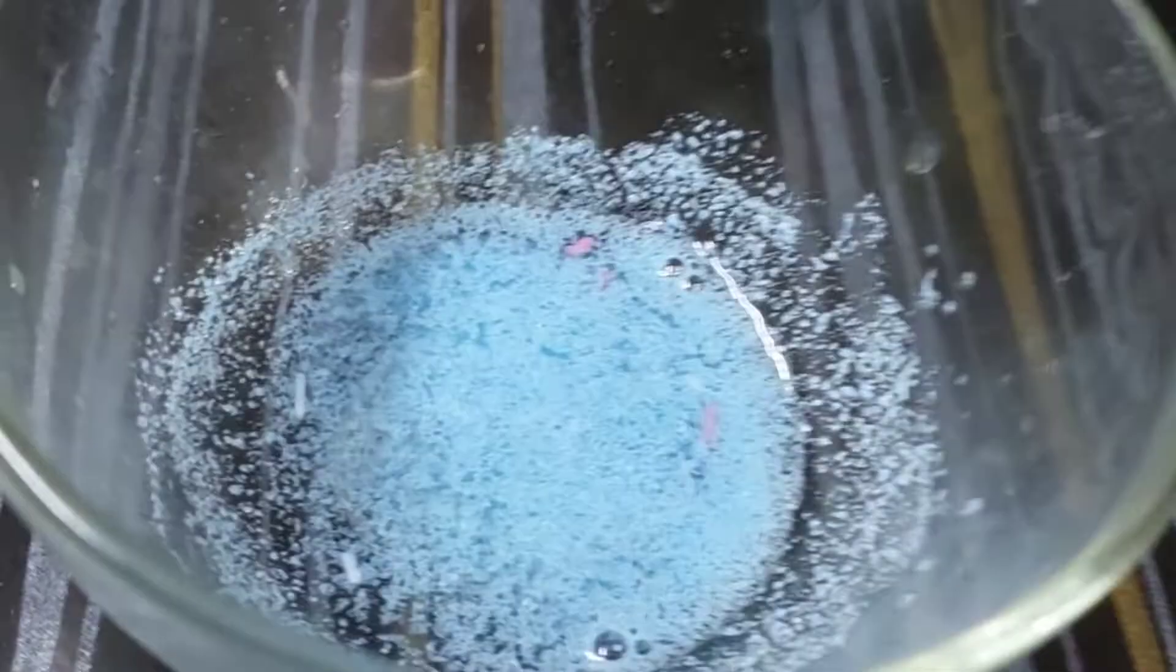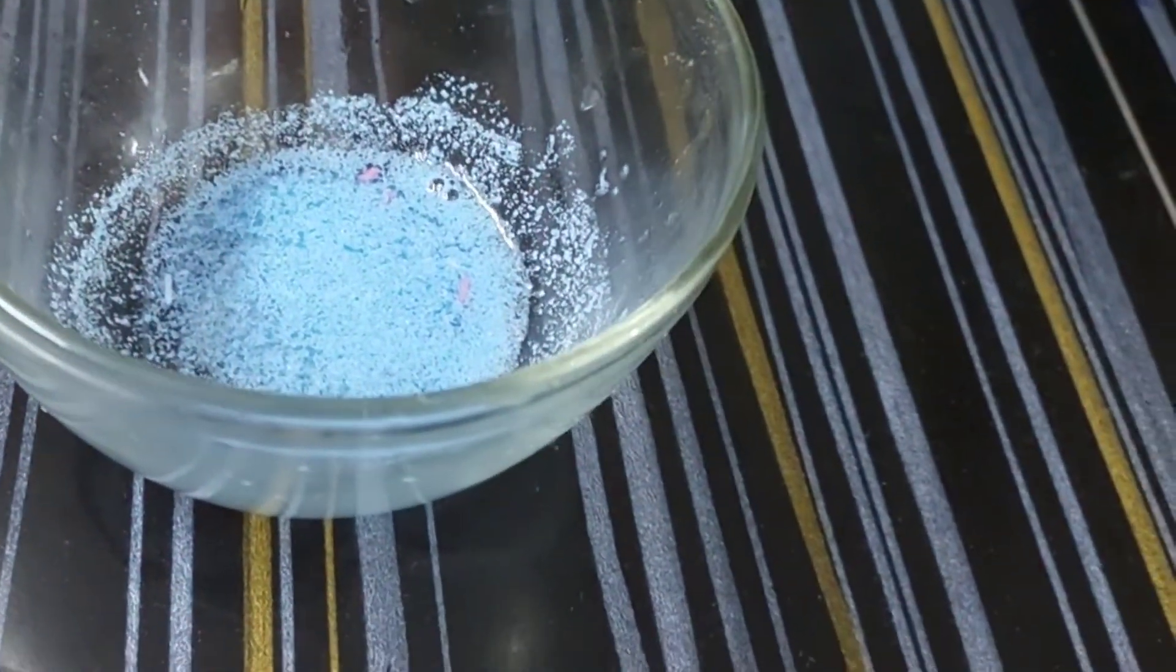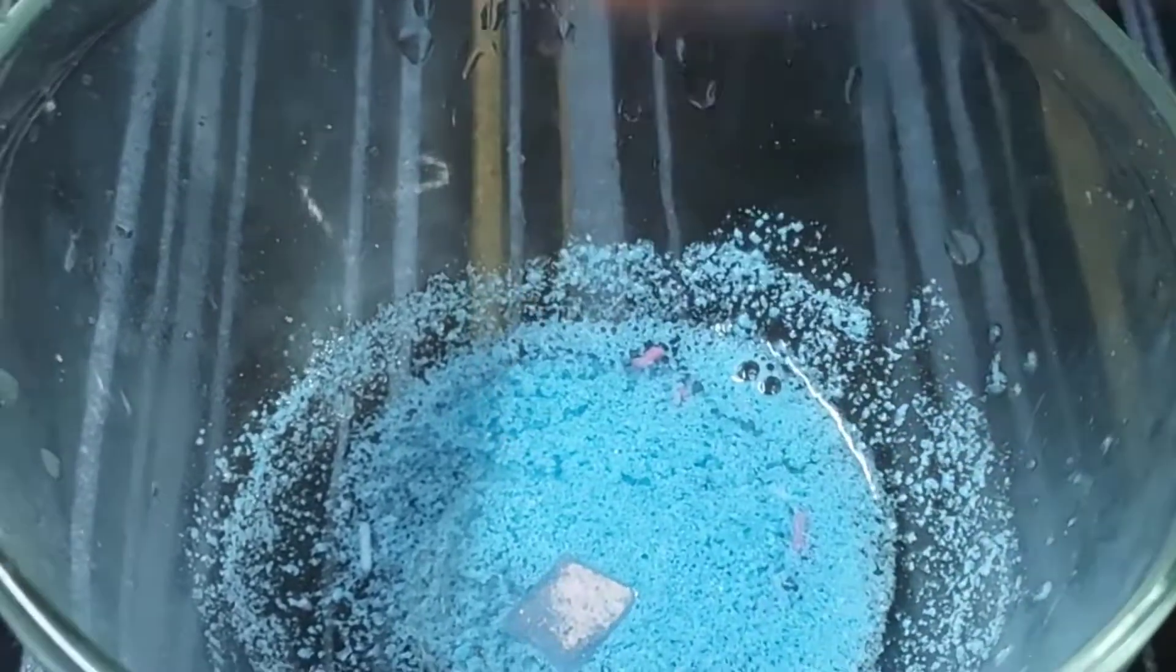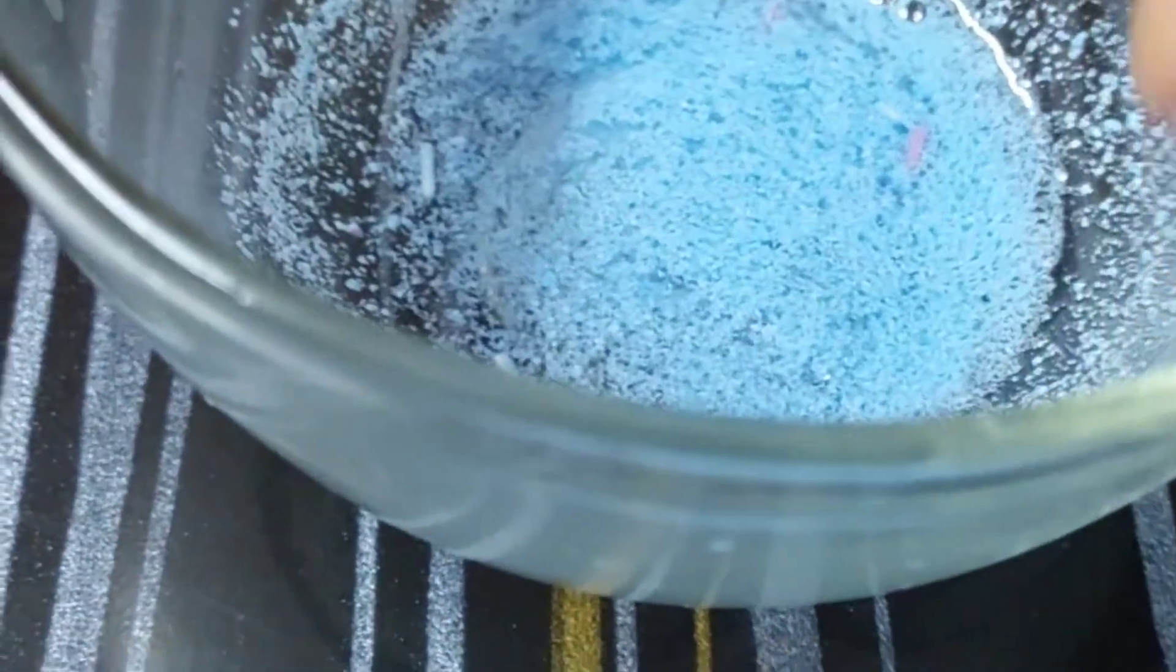Now we have washing powder solution. We'll put red litmus paper into this. Here you can see it is converted into blue litmus paper, which means it is basic in nature.